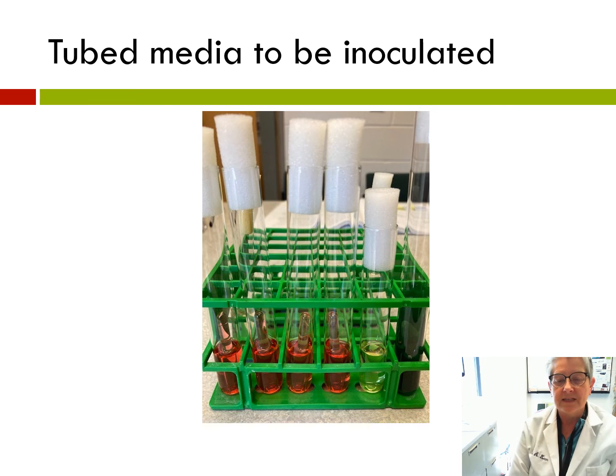The next tube, the second from the right, is just that nitrate broth. Again, all I'm showing you here is that an uninoculated tube is just clear. There's nothing growing in it. And then that tube on the far right is the Simmons citrate. Right now you can see that that's green. No bacteria has been inoculated there, but when we inoculate your bacteria, if we get that blue color change, it will be because your bacteria can catabolize citrate as its energy source. The pH will rise and the green media will turn blue.